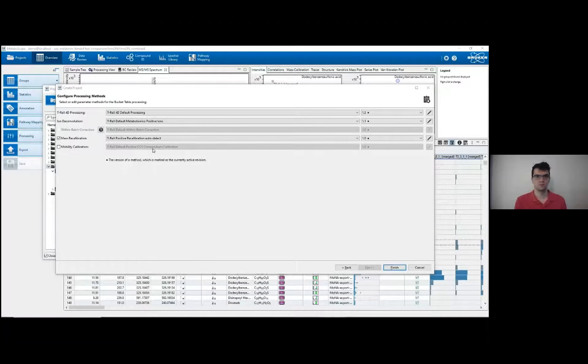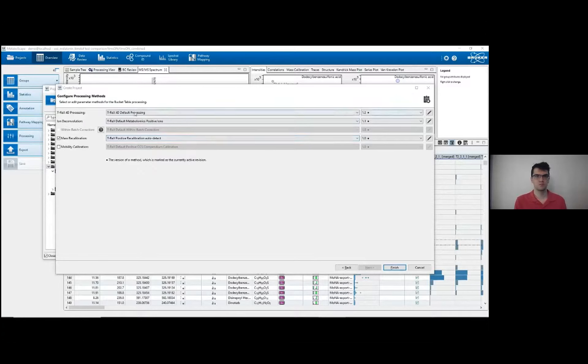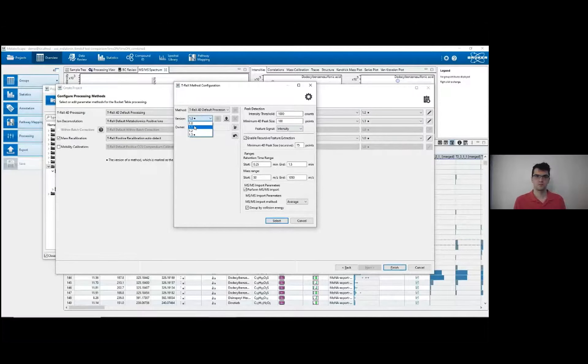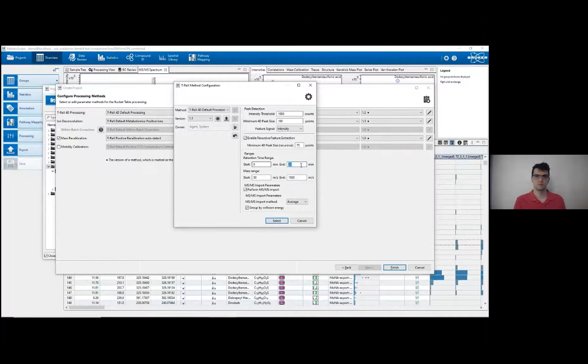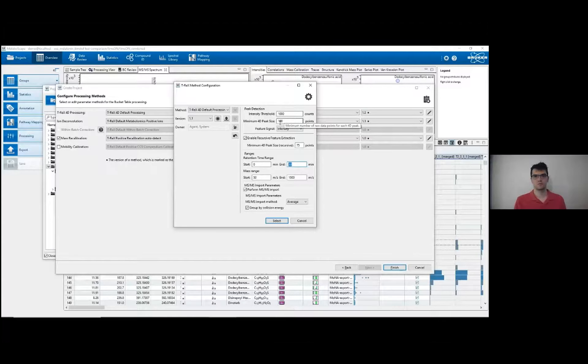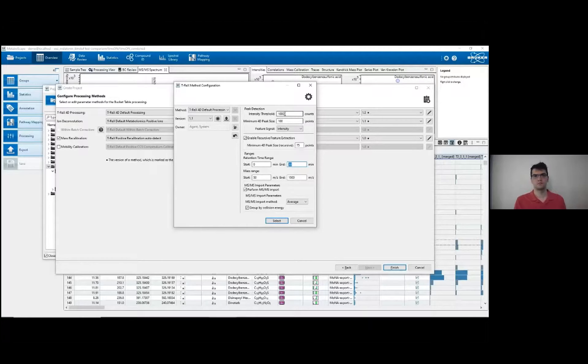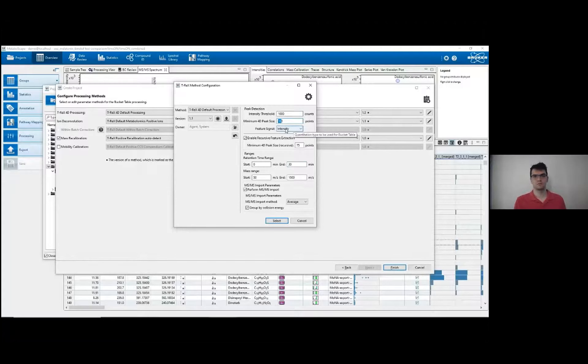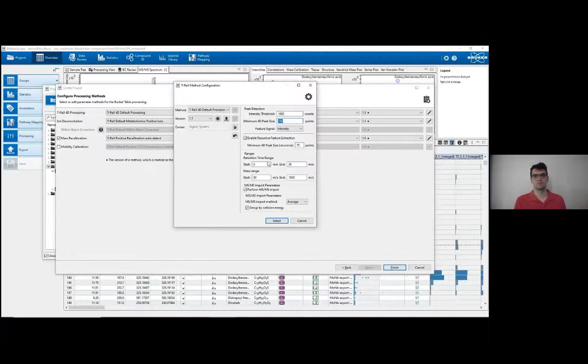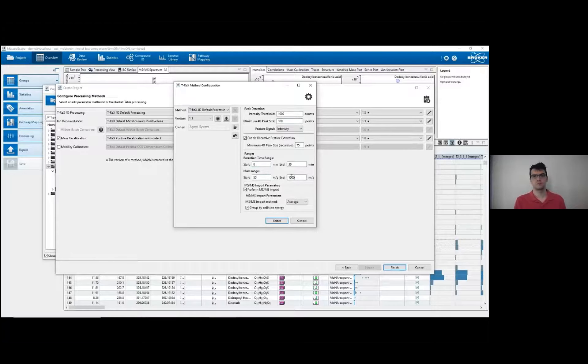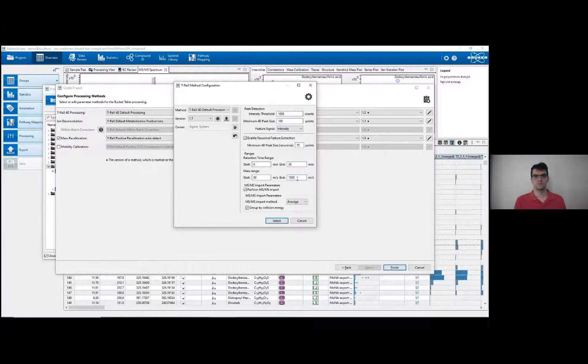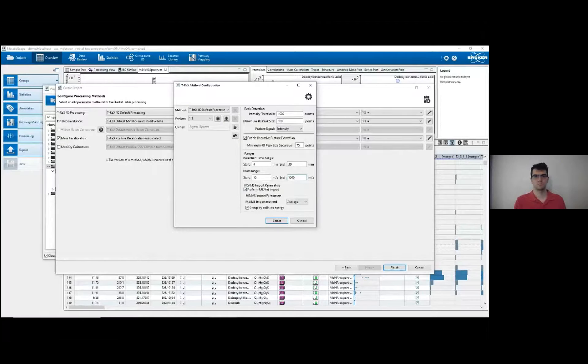Here we have the processing methods for the identification algorithms. First, I'll go into peak processing. That is the T-REX 4D algorithm. I can edit the algorithm here. I'll switch it to version 1.1 because it has a 30 minute retention time, which is appropriate for the LC we were using. Up here we have peak detection with the intensity threshold and 4D peak size that's related to the trapped ion mobility data. A thousand and a hundred counts are generally appropriate for these settings. Recursive feature extraction here uses a lower number of points to identify peaks that may not have been picked up before with these higher quality settings. Retention time range, as I said, is right here. We also have mass range. 50 to 1500 is very broad, so this should pick up everything, but you could lower it or raise it to be more or less stringent depending on your tuning settings for the mass spectrometer. We also have the MSMS import parameters here. These are kept on because we need MSMS for annotation later.